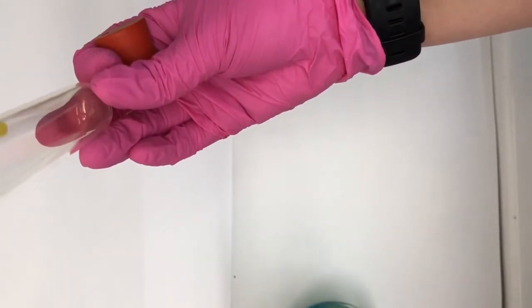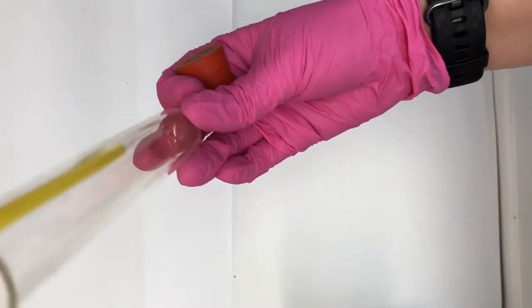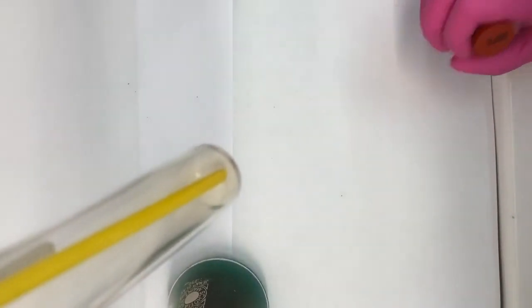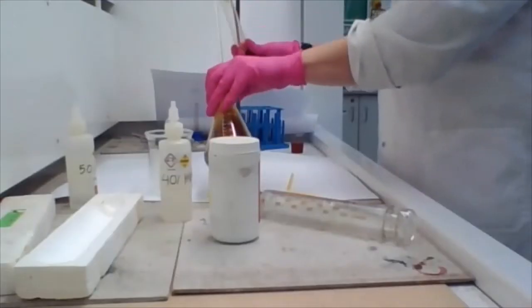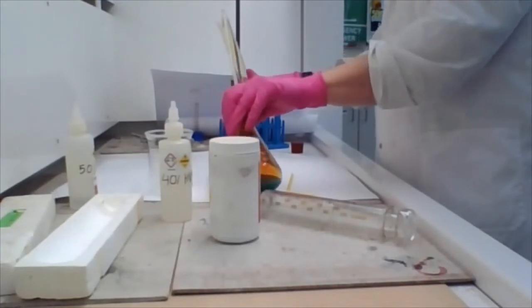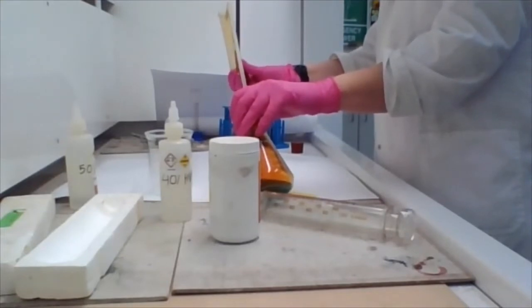So I took off that straw and used the delivery tube directly into my test tube. You can see it's getting slightly yellow, but not quickly enough. You can see there that I've removed that plastic straw and I'm just putting the gas directly from my delivery tube into that test tube.